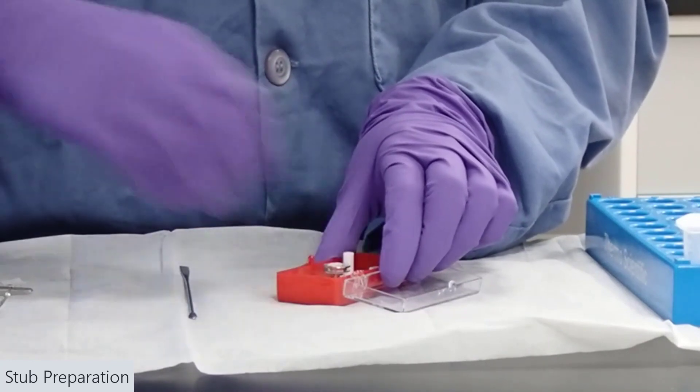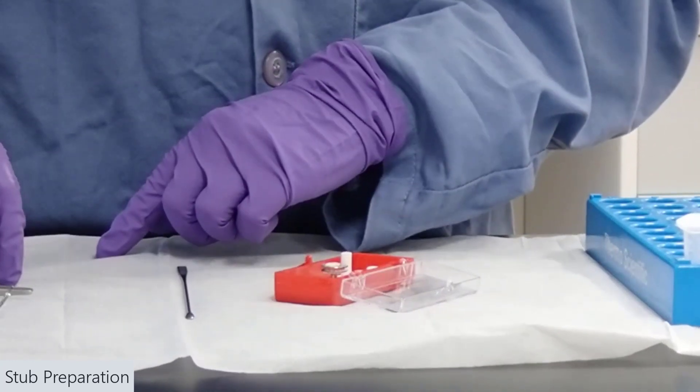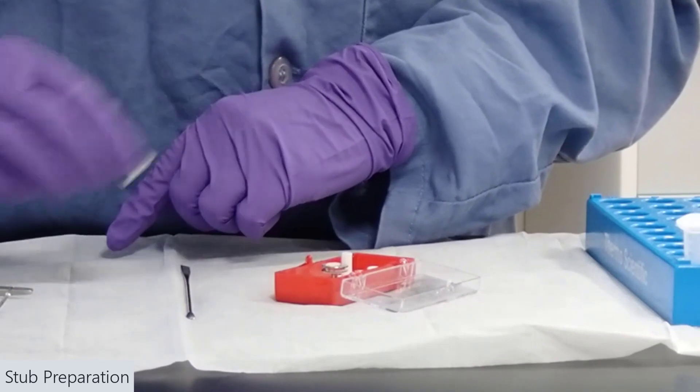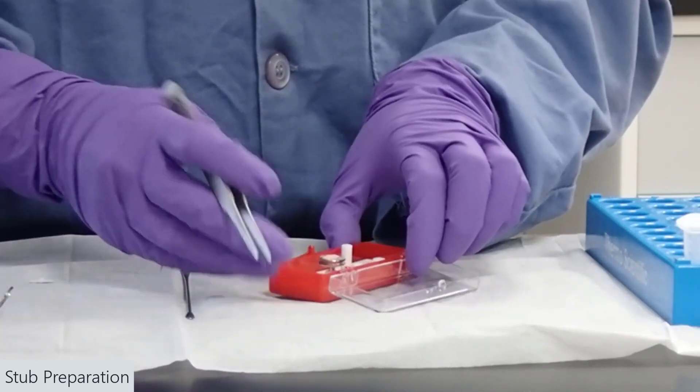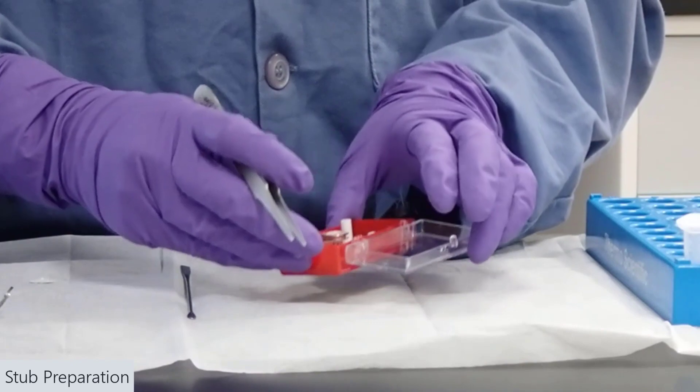So, we'll put the aluminum stub in the stub holder box, and then cut off and put down a piece of double-sided tape. I've already gone ahead and done that with copper tape in this example.